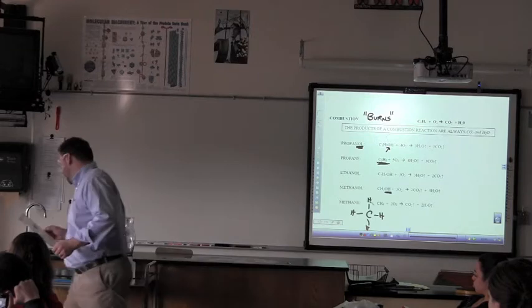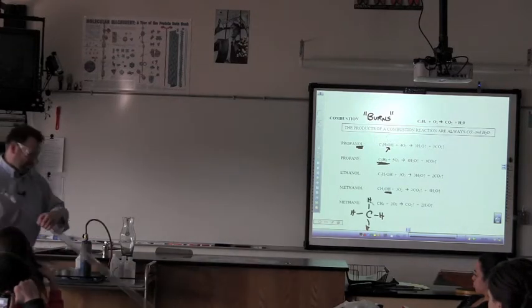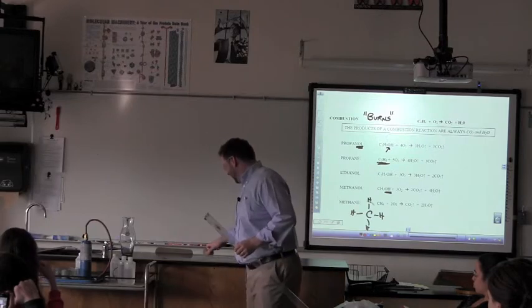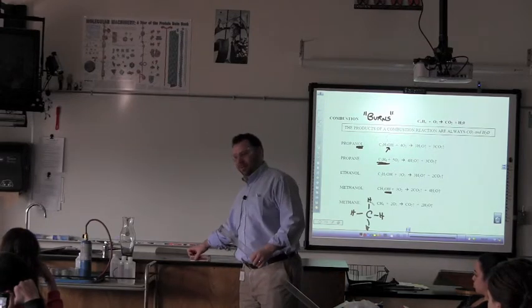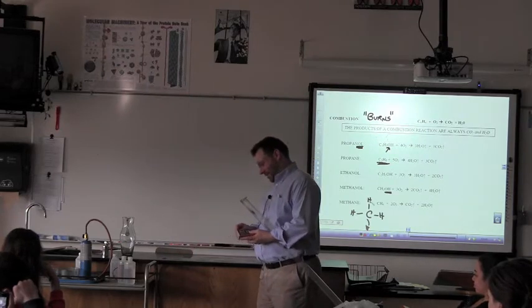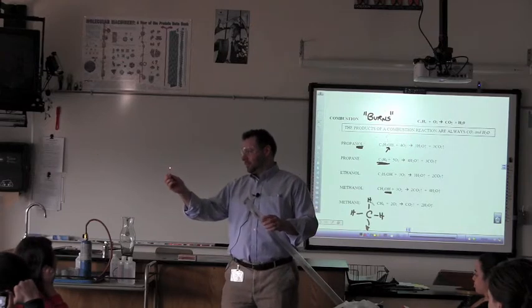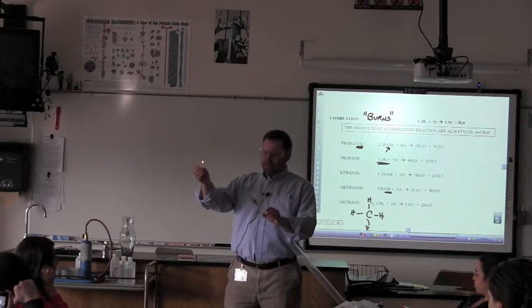We'll get ourselves a match. You want I should aim it at you? No, you're okay? All right, you sure? All right. Okay, so here we go. This should be nice and ready.